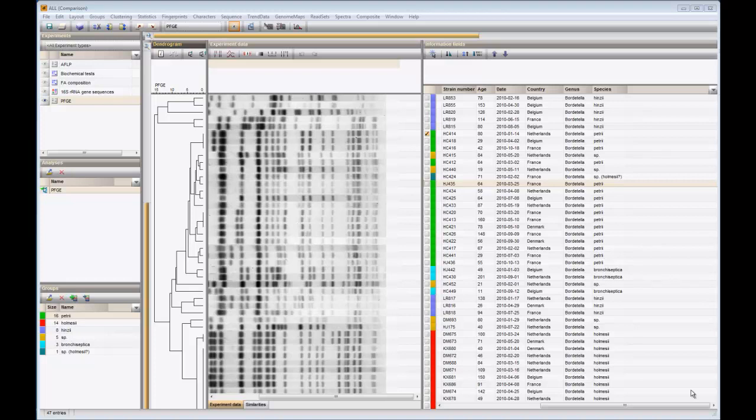When clustering fingerprints based on band matching, you will often wonder why patterns look identical and yet do not cluster at 100% similarity. Band definition relies on thresholds, and sometimes a weak band may be found on one pattern and not on another. It is therefore very convenient that we are able to edit bands directly in the comparison window.